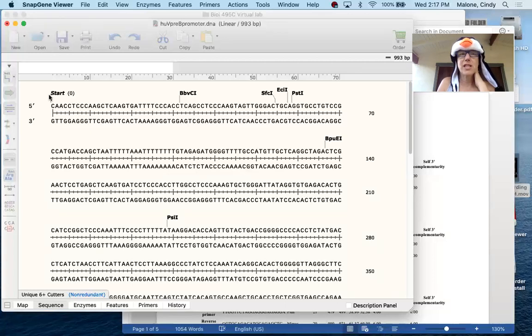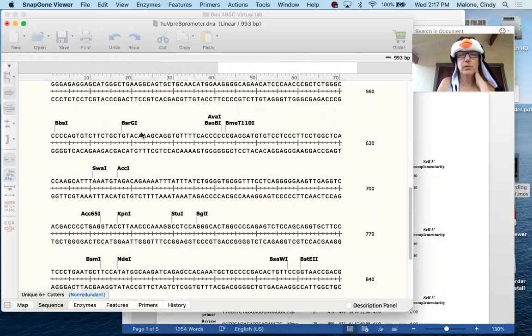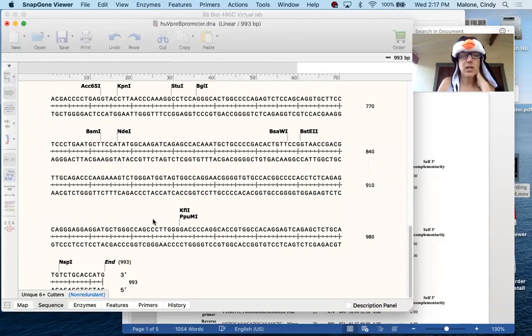So this was in the white, and then as we went all the way down, right here is my first ATG. So this was where my 5' UTR was. I should annotate where that actually is, but I don't have that right here. But I know I'm really close to the first ATG because there's the first ATG. So I copied my sequence in. So if you don't have a SnapGene file yet, take a pause and go set your guy up.